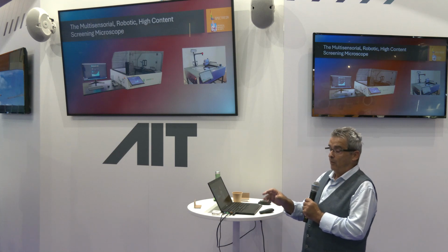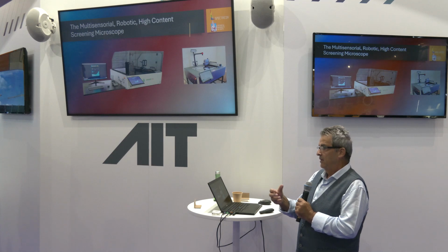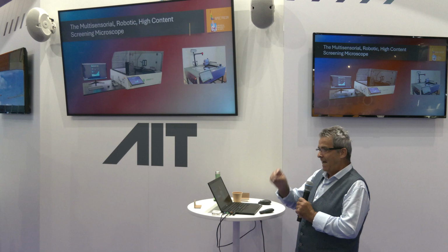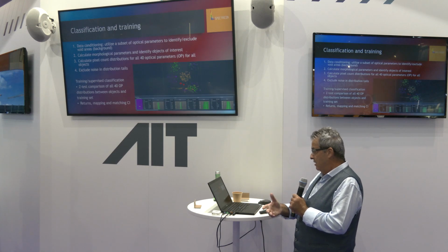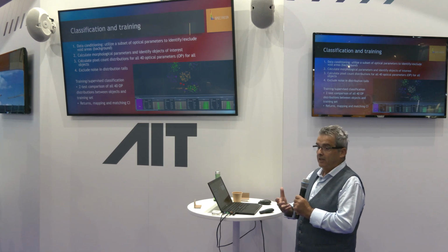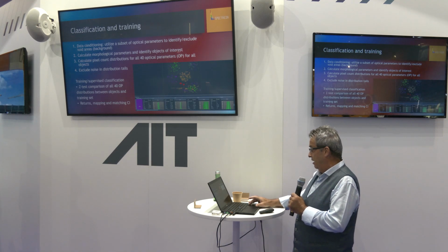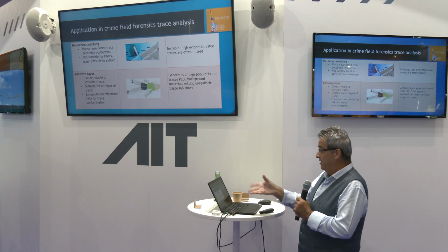And so all these images provide complementary information. It's very unusual for different materials to have exactly the same characteristics in all these imaging modalities, which give us, as I said, complementary information. And at the end, we are generating a training data set with ground truth material, where these feature maps are correlated to particular chemical identity maps. This is an example.